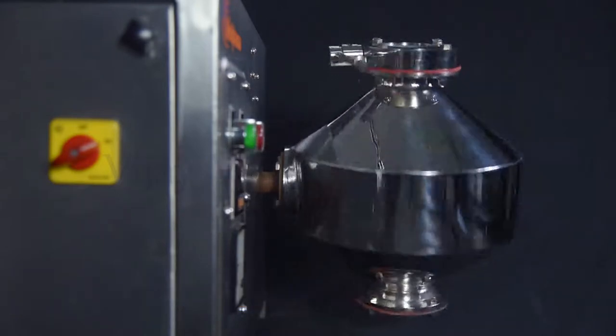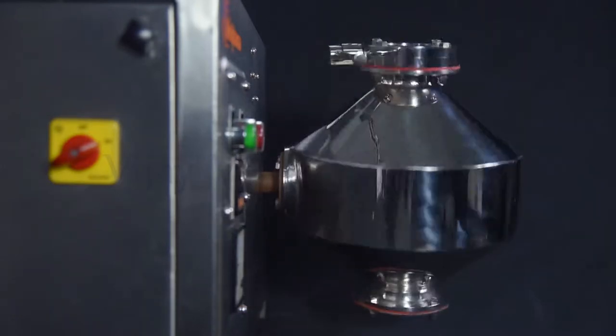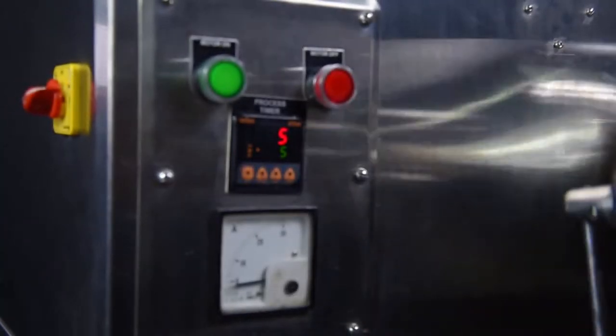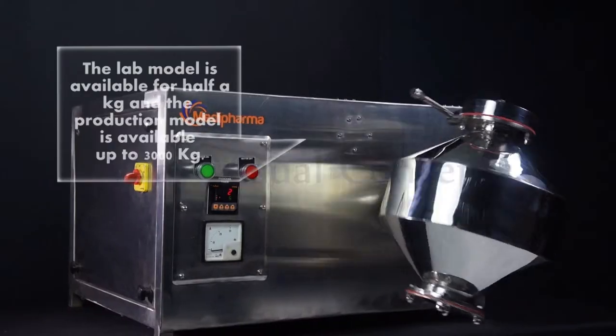Double cone blender produces a homogeneous mix of dry formulations for capsules. The panel facilitates a three-phase indication DOL starter, digital timer and limit switch.